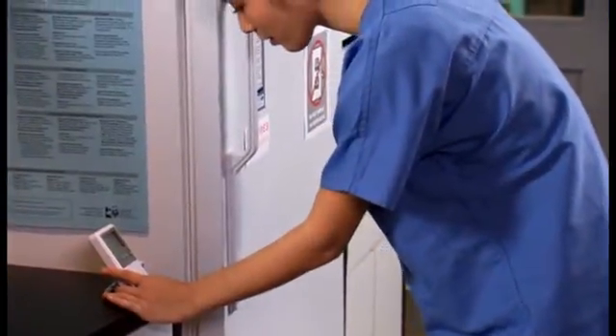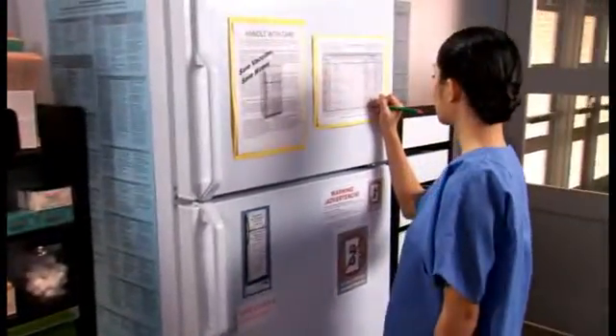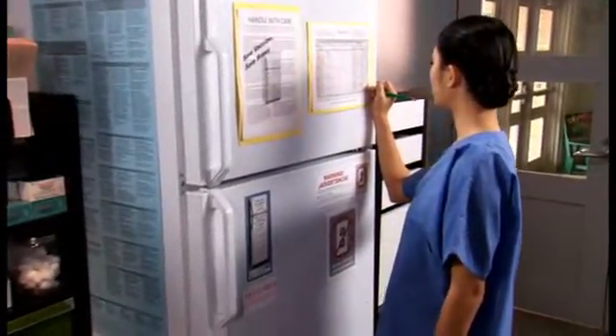You must check the refrigerator and freezer temperatures twice a day — once in the morning and once before you leave at the end of the workday. Record the temperature on a log sheet or calendar kept on the refrigerator door. Temperature indicators and around-the-clock monitoring systems may be used to alert staff, but they should not be used as a substitute for twice-daily temperature readings and documentation. As the refrigerator ages, you can track recurring problems or identify how long a problem has existed.